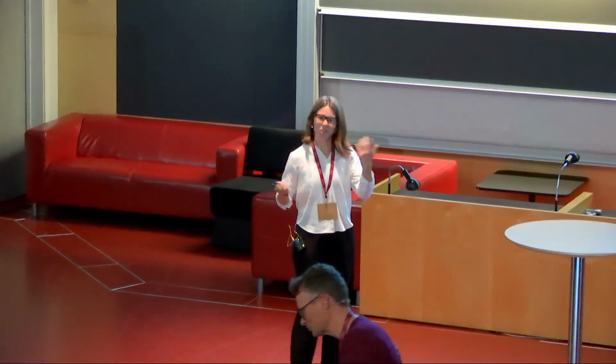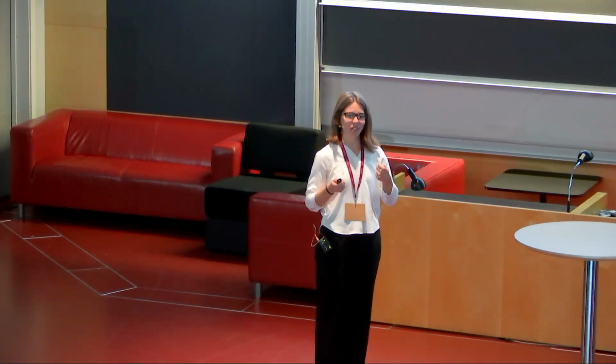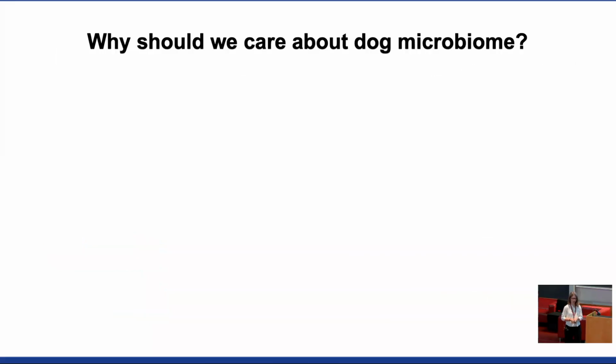So yeah, first I would like to thank the organization for giving me this opportunity to explain a little bit what I have been doing in Shanghai. We have been characterizing the Shanghai pet dog microbiome using long-read metagenomics.